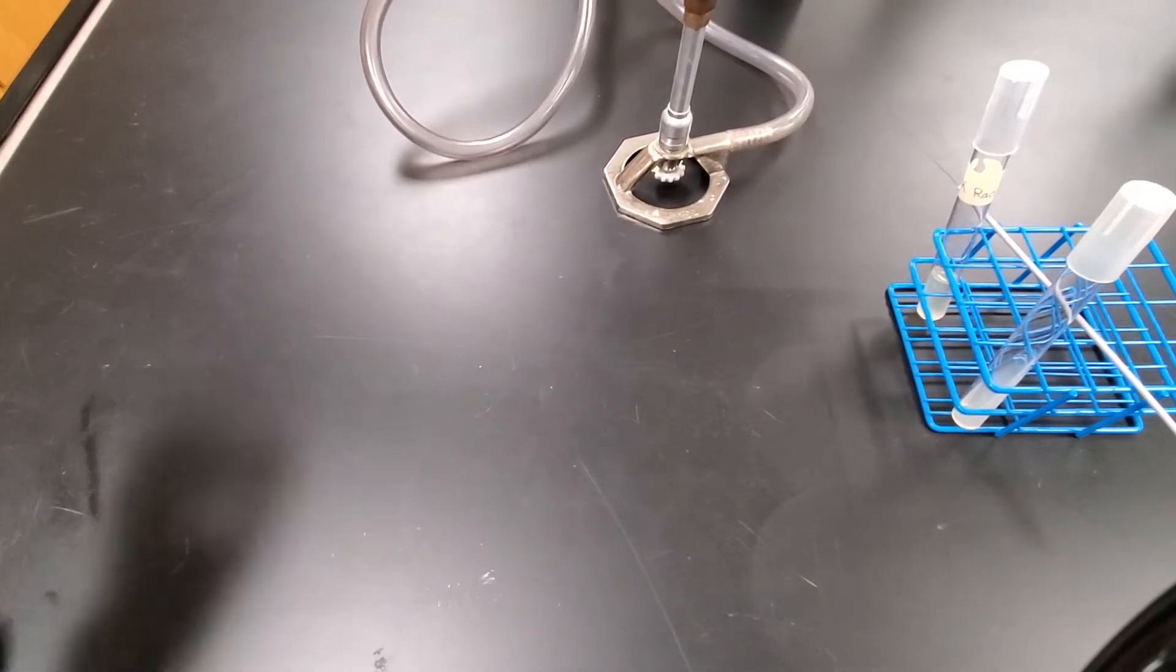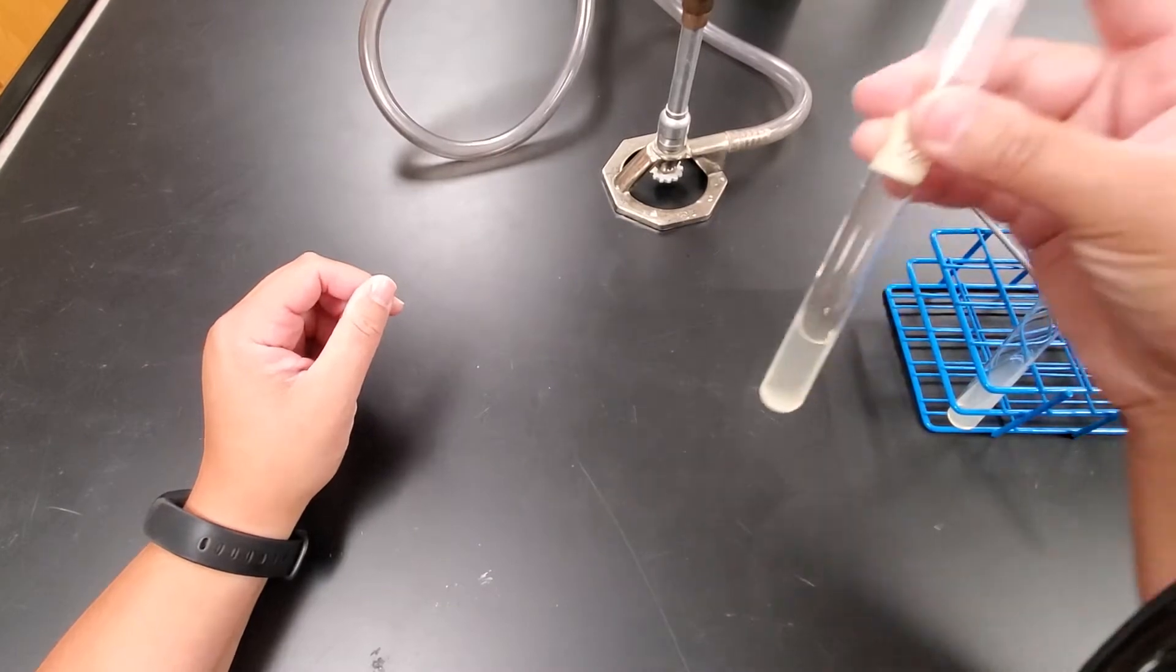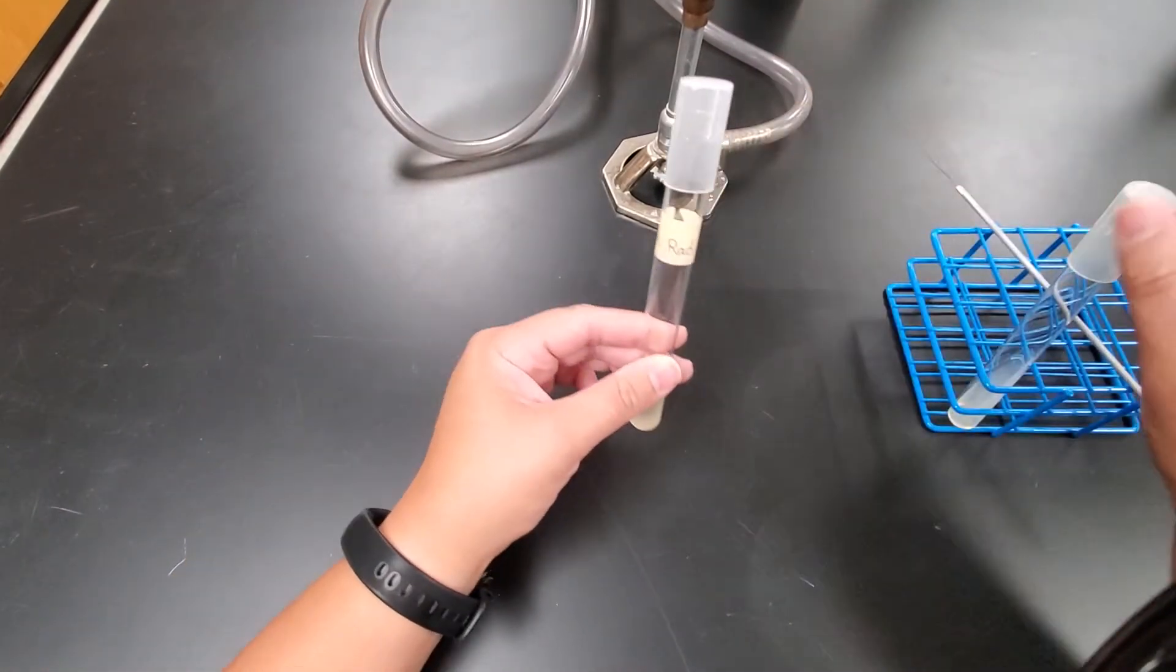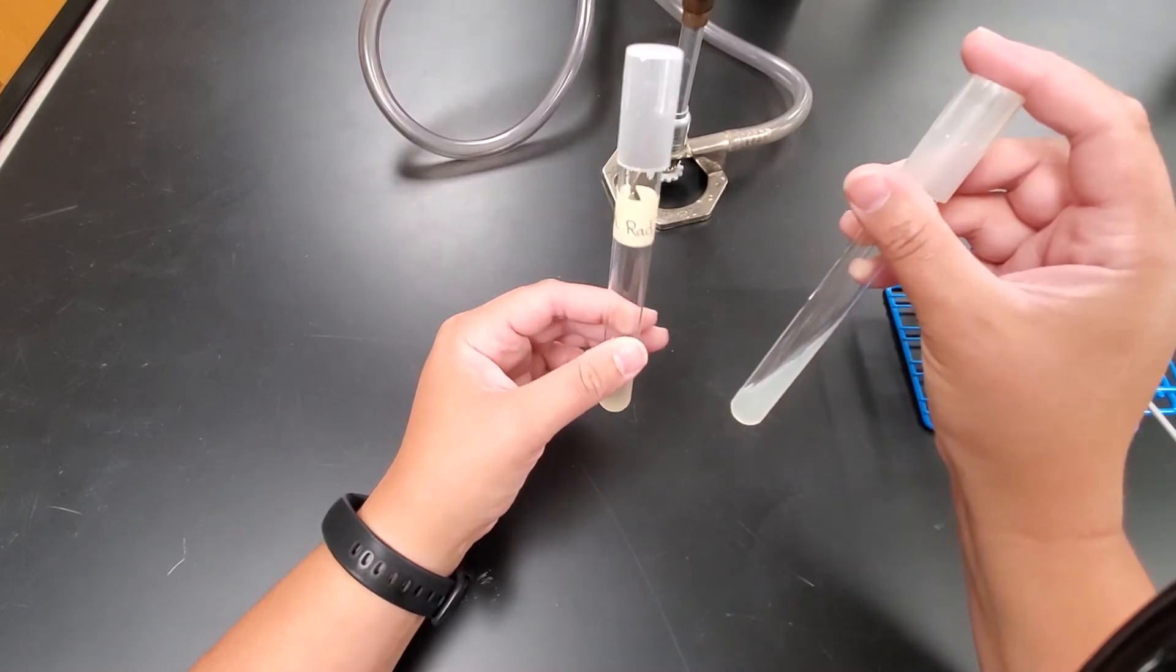All right, so what we're going to be doing today is a culture transfer. We have our broth tube from our yogurt, and we're going to transfer a sample to an agar slant. You can see it's slanted in a slanted position.